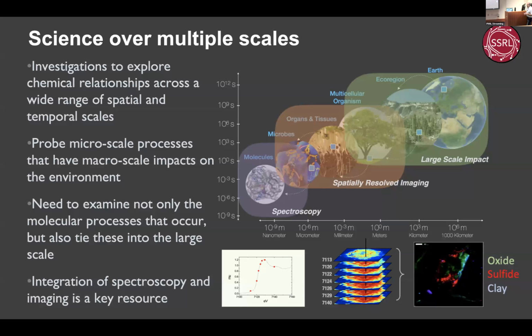I think this is another theme of our integrated workshop here: really doing science over multiple scales with multiple modes of data, right? We have all these spectroscopic tools that give us atomic resolution ideas of what's bound to what, and what the chemical species are. We combine this with microscale to macroscale imaging to see how that varies over millimeters to, if you're crazy like I am, meters.